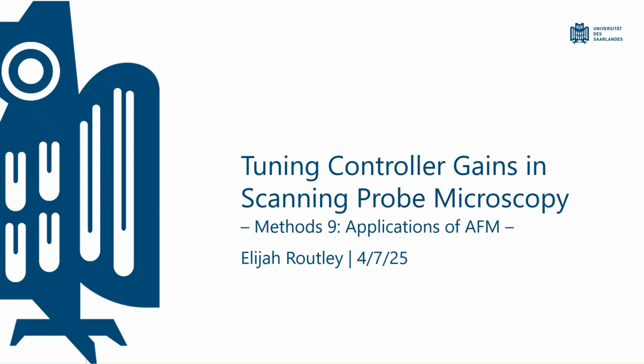Hello everyone. Today we're going to be doing a quick video presentation on tuning controller gains in scanning probe microscopy, which is a topic central to achieving stable, high-resolution surface images.